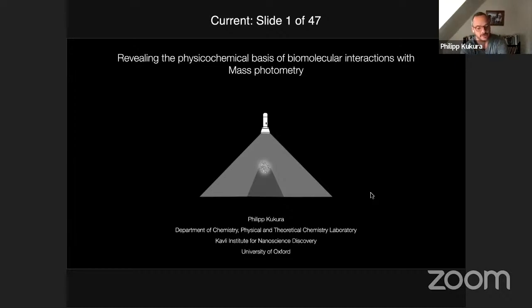I guess you have dynamic light scattering, multi-angle light scattering, right? So people use fluctuations in light scattering to find out about the diffusion coefficient of objects. That's a bulk method. If you were to do it like in confocal FCS, you would see the same thing. In the absence of the probe diffusing through your confocal detection volume, you would see nothing. And if something comes through, you would see a spike.